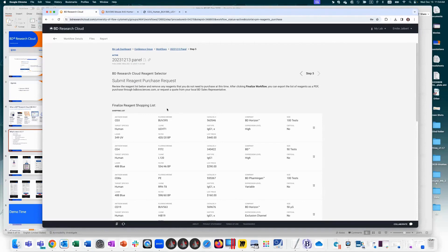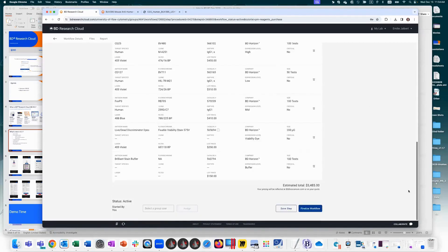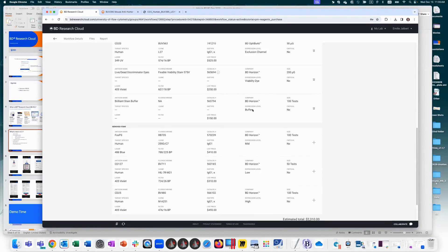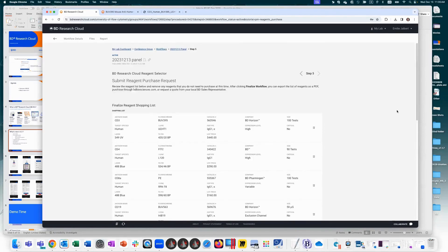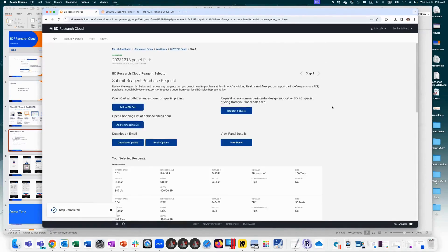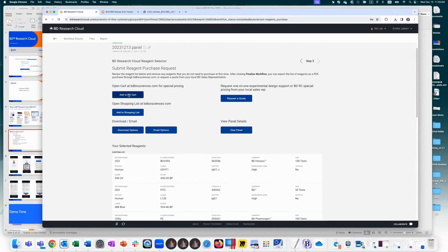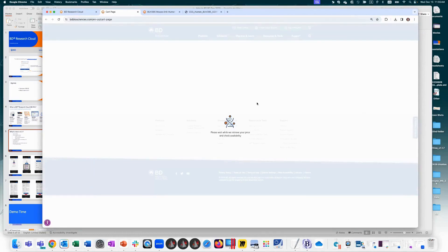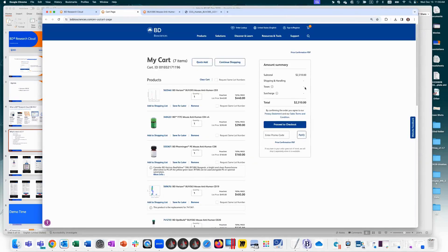The last step finalizes the shopping list. If you want to purchase all reagents, continue. Delete any you already have. If you have access to the inventory feature, a checkmark indicates which reagents you already have in your lab — or remove everything already in inventory with one click. You can go straight to BD cart for direct purchase with institutional pricing, create a shopping list compatible with punchout, download the panel summary or shopping list, email it to your admin, or request a quote to contact your reagent rep.